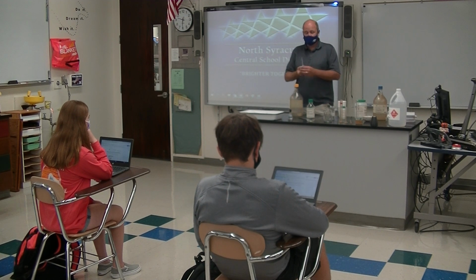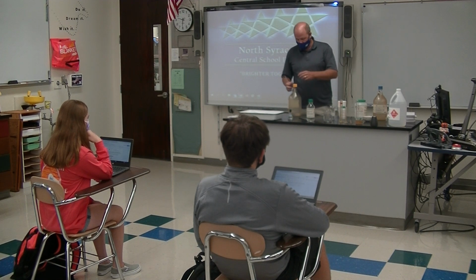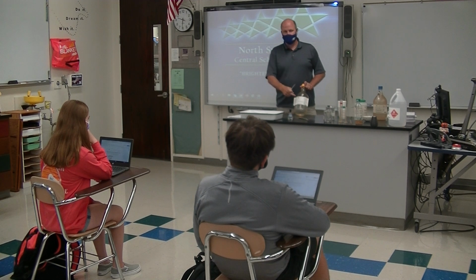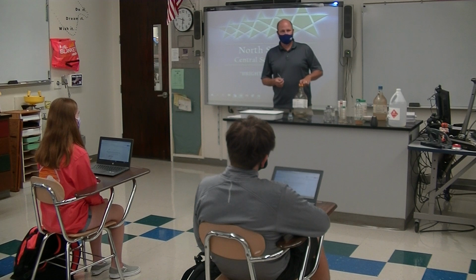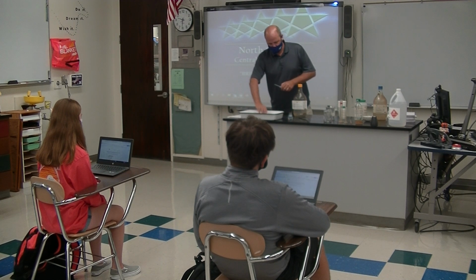So I'm going to use this right now to transfer this stuff up here. When you come into class, don't mess with this stuff up here because usually you're not going to know what it is, and it could be potentially harmful for you. So here, I'm going to take this stuff right here. This is called sulfuric acid. This is the second nastiest acid we have in the building. This stuff will eat through skin, bones, dissolve tissue, all kinds of fun stuff. I would probably almost never give this to you in full strength form, but I'm going to show you what happens when it is in full strength form.